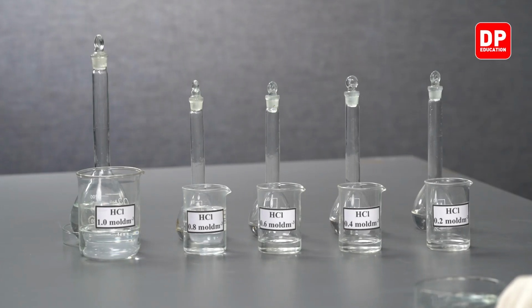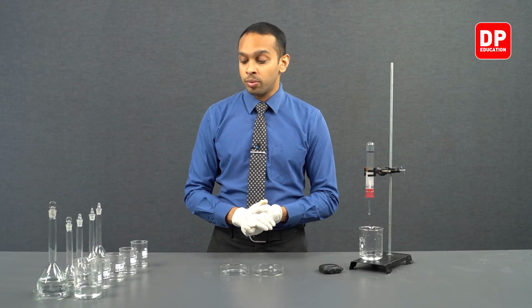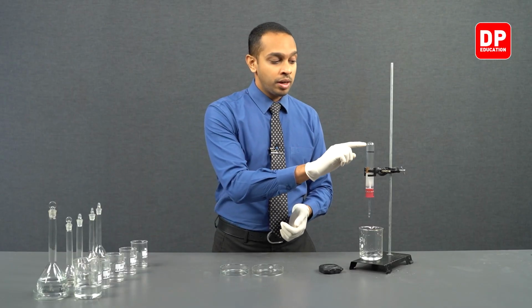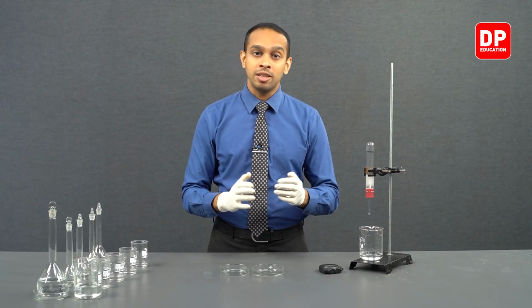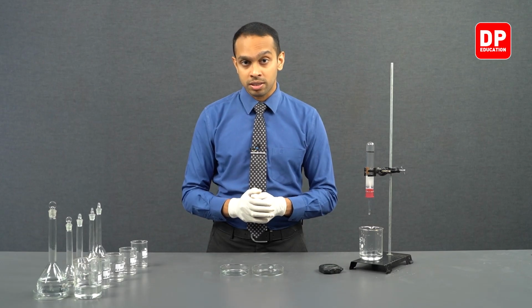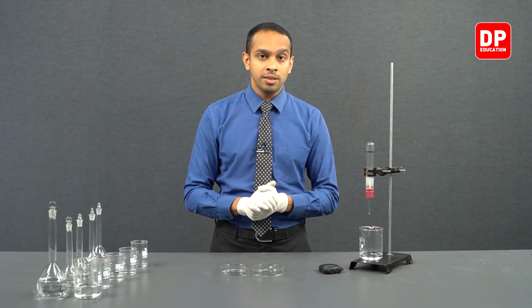And now we have 27 seconds taken for the magnesium strip to react with HCl to produce hydrogen gas all the way up to this mark that we have made on the boiling tube. So we can now have an idea that this reaction is happening faster when we increase the concentration of HCl. Higher the concentration, faster the rate.